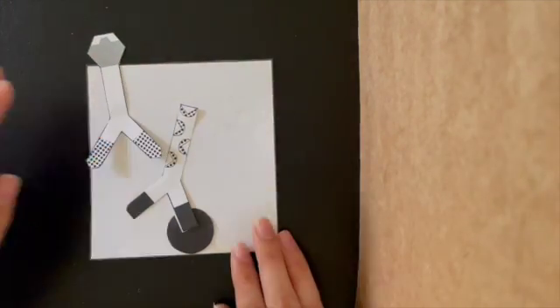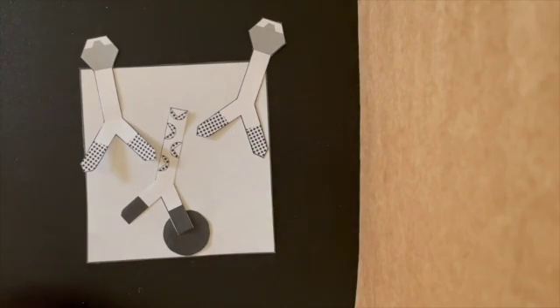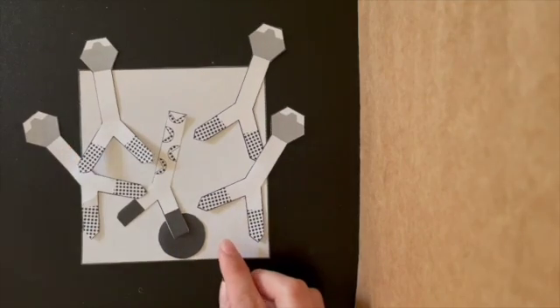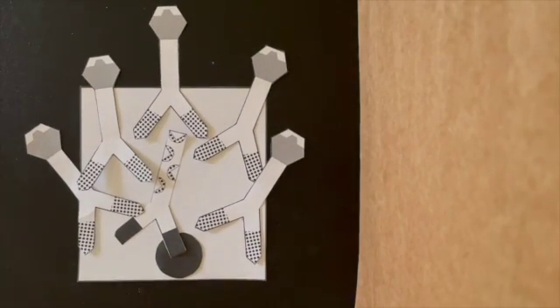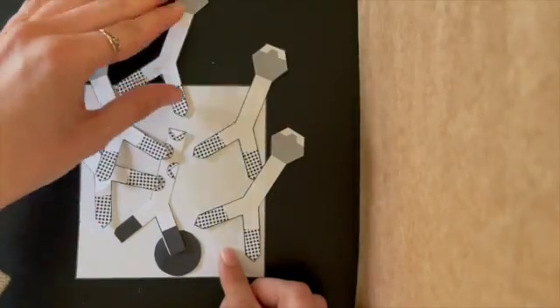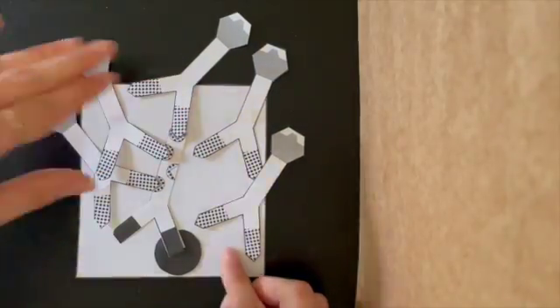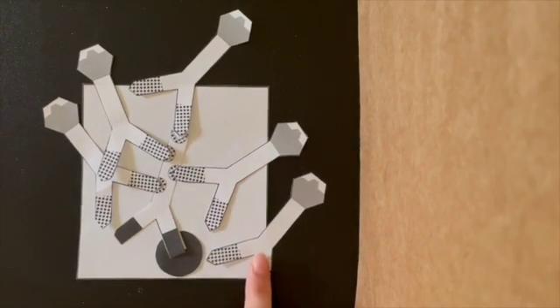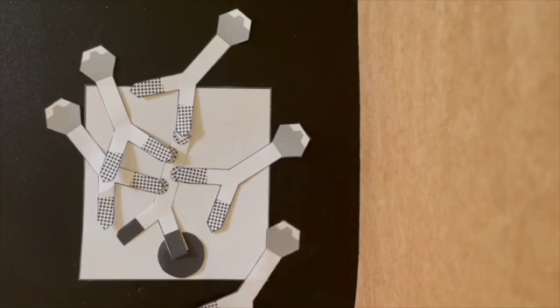Once the interaction between the antigen and antibody has been established, enzyme-linked secondary antibodies are added into the well to bind tightly to the primary antibody. The sample is incubated for an additional 5 minutes to enable the interaction between the primary and secondary antibodies to occur. A wash buffer is added to the well to remove any secondary antibodies that did not bind the primary antibody. The process is further repeated 2 more times.